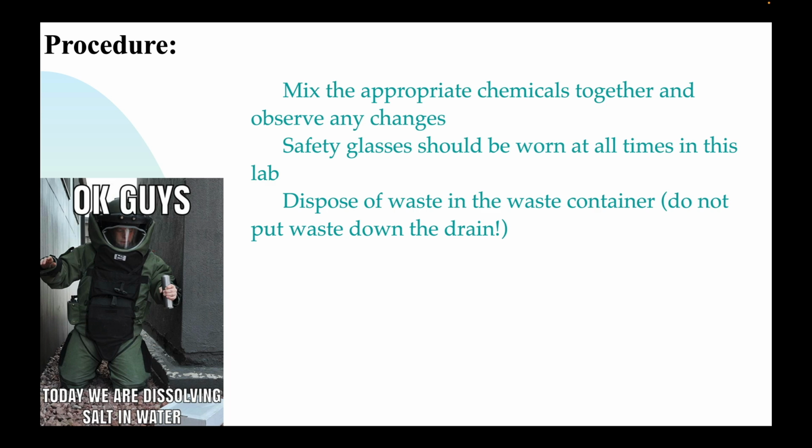And again, you're welcome to have a big beaker, and you can dump all the waste in there, and then at the very end dump the beaker into the waste jar, that'll save you from going back and forth all the time. But of course, it's totally up to you.